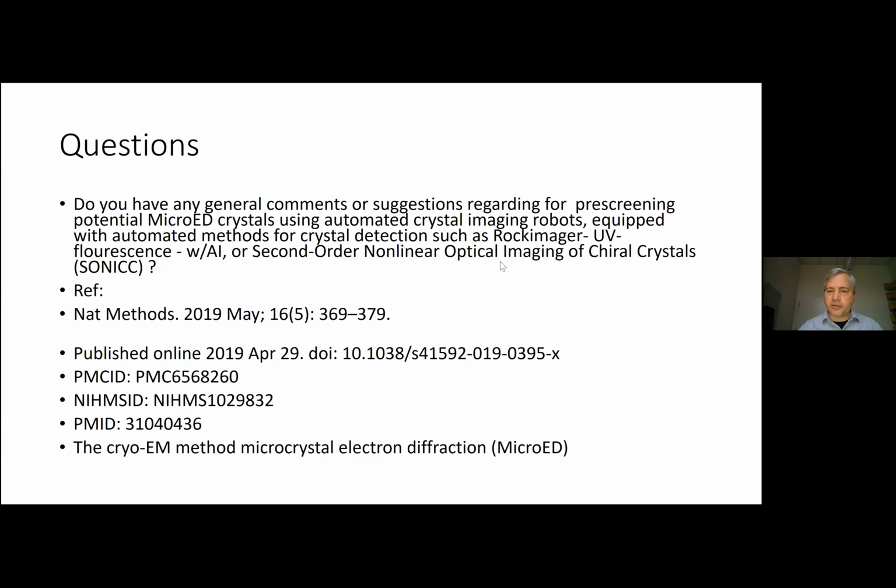Along the same line, what kind of solvent background is best for MicroED? Because you're collecting diffraction patterns, you're not as hurt by the solvent background, because you're not imaging, you're not looking for a small molecule that's floating in solution. You have a crystal that's easy to find, and you do a diffraction pattern of it, and you're only looking at the diffraction spots. So I think that helps you a lot.